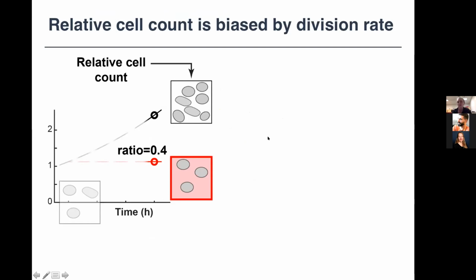And so if we take a closer look now and start to think about what's happening with cell lines that have different division times, which for any of you who are wet lab biologists like me, you can appreciate that having cells in culture, they have wildly different division times. Sometimes you need to passage cells every 2 days. Sometimes maybe you only need to passage your cells once a week or even less.